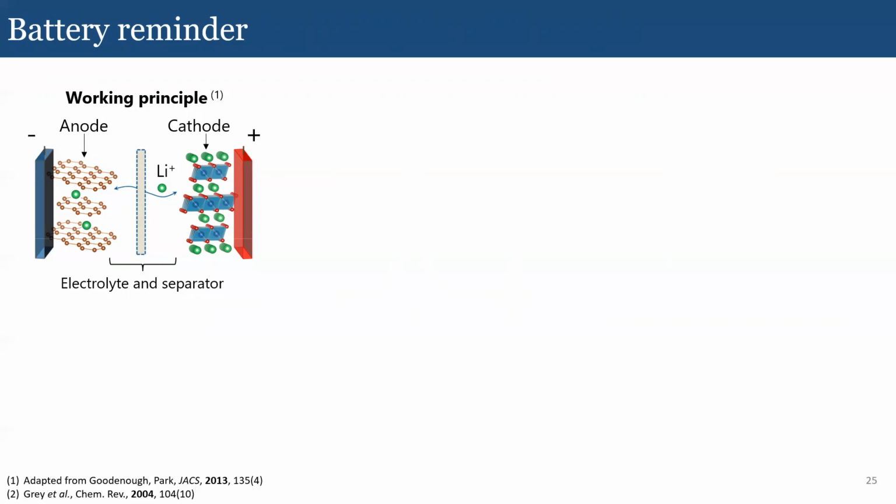Yeah, so now I've talked about the theory. It's done. You can start to breathe again. So why am I talking about NMR of batteries? I'm not going to explain how a battery works, but just quick information here. I'm going to focus mainly on lithium-ion batteries, but most of the things that I'm going to say are also applicable to sodium-ion batteries.